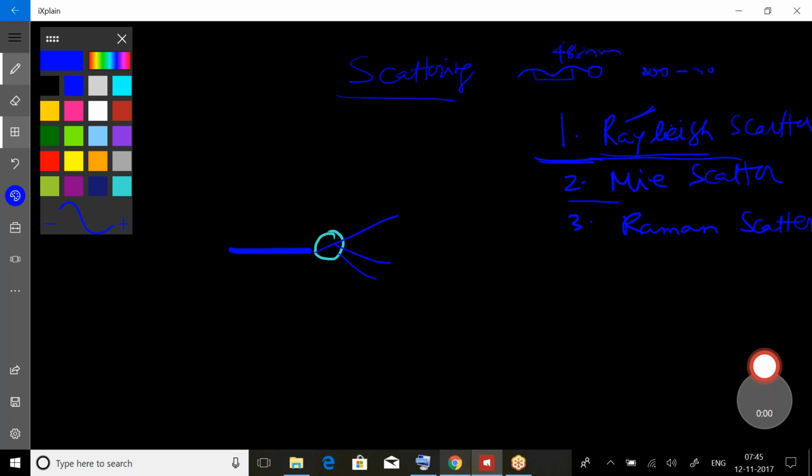If you talk about the dimension of the cells, mostly when we consider bacterial cells, say for example, 1 micrometer to somewhere around 50 micrometer cells that we are studying, in the wavelengths that we use on the flow cytometer, the maximum is the far red laser.